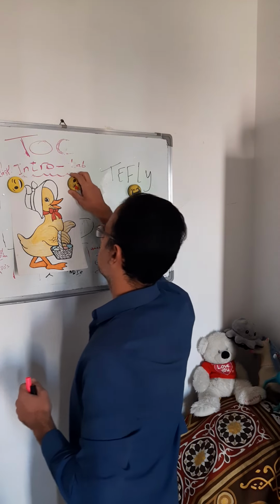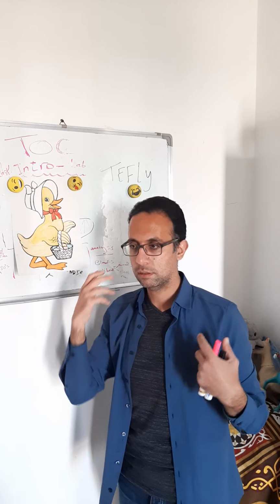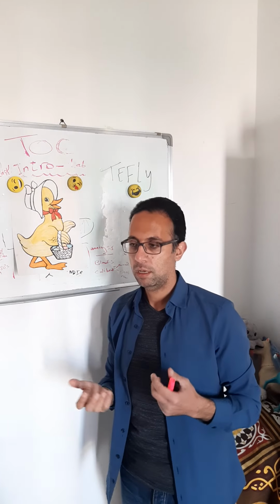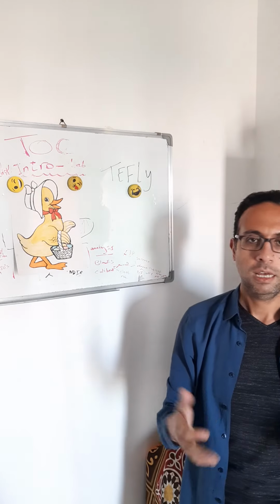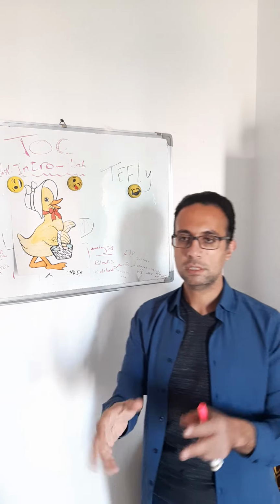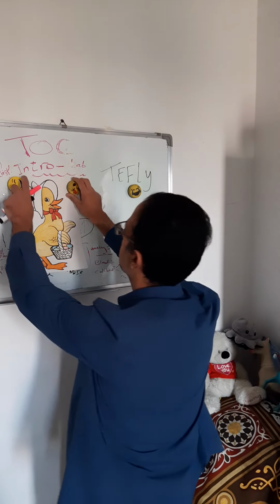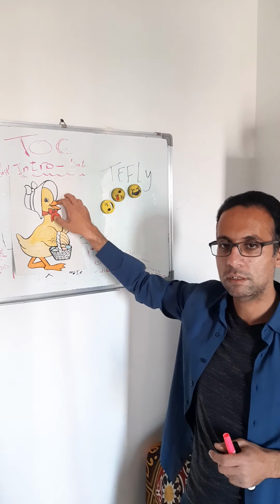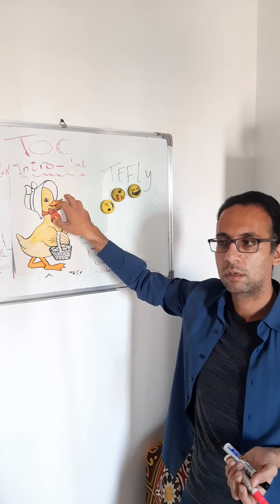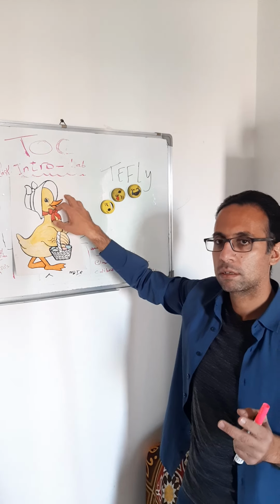So before we talk about instruments, we think about the theory. The first thing that comes to mind is how this instrument measures a specific parameter, for example TOC. Should we take a look at TOC? Do you have an idea about how TOC is measured? Titration, carbon titrated? No, something like that.